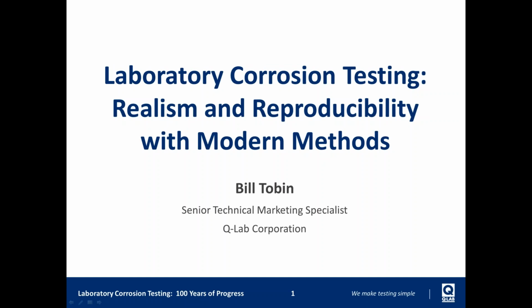As mentioned, my name is Bill Tobin. I'm the Senior Technical Marketing Specialist here at QLab. And today we're going to be talking about laboratory corrosion testing. Just as a primer ahead of time, when we talk about corrosion testing in this, we're primarily talking about atmospheric corrosion, which is going to be different mechanisms than chemical corrosion or underground corrosion with like pipelines or something like that.